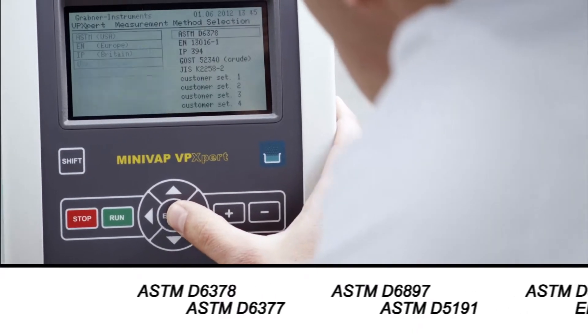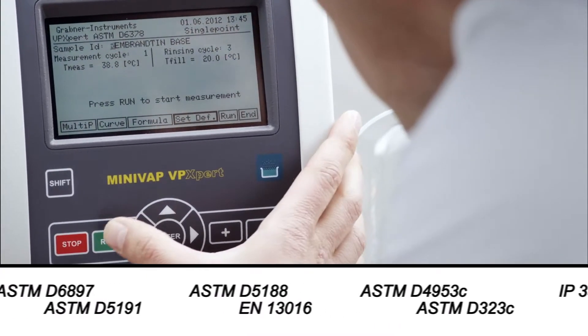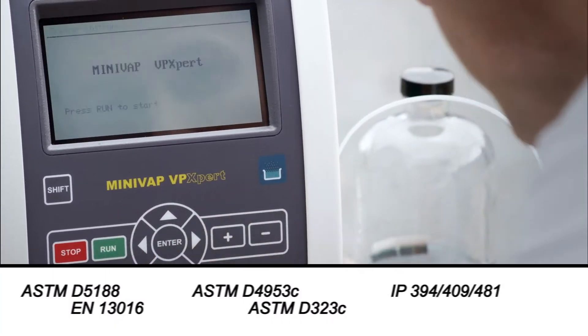I can measure the absolute or the air saturated, the total or the true, the dry or the wet vapor pressure. According to all major industry standards.